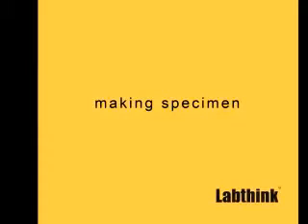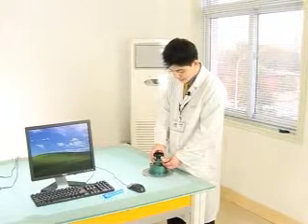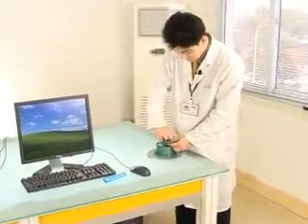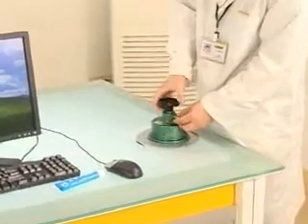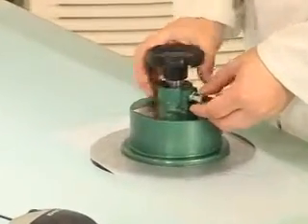It's okay. Pull this knob out, let it down, and then turn it. Pull it up, let this knob back.